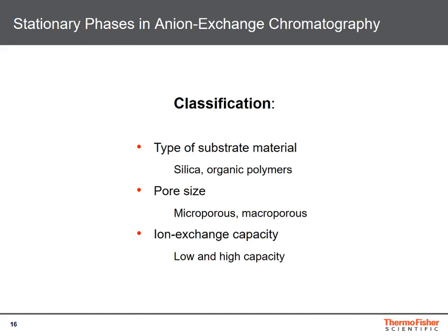Regarding the pore size of the substrate materials, we differentiate between micro and macroporous ones, and this is related to the ion exchange capacity. That means microporous materials are usually of low ion exchange capacity, whereas macroporous substrates are related to high capacity materials.